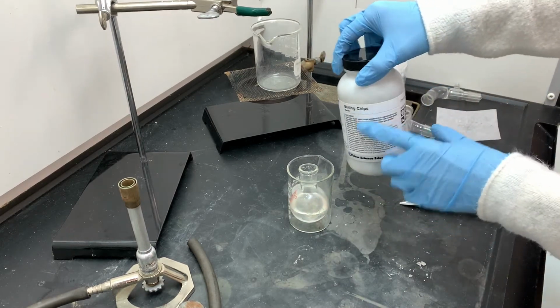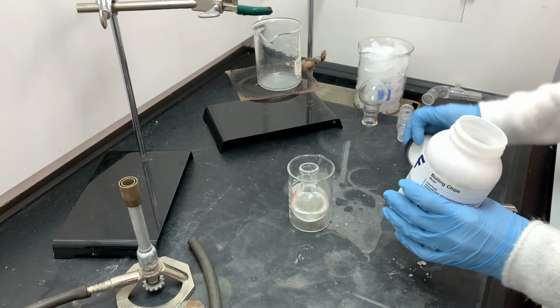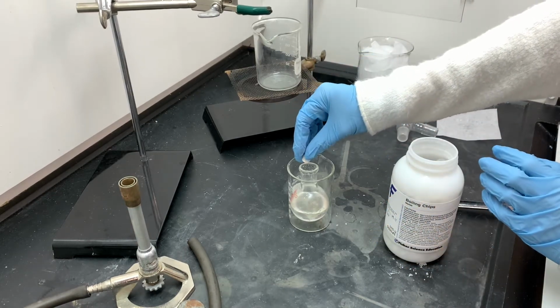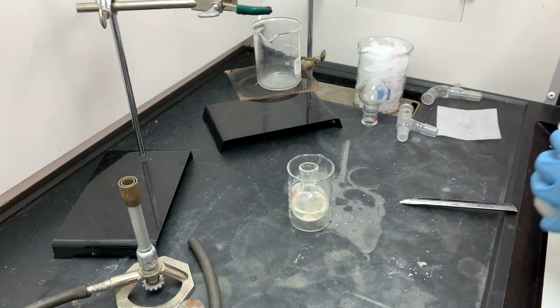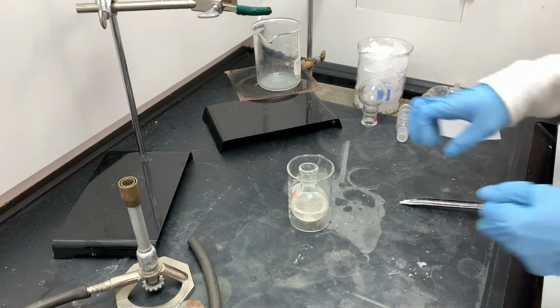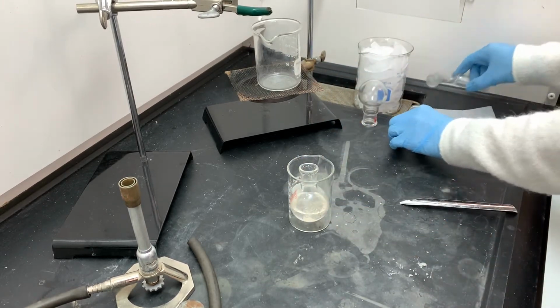The last component is a boiling chip. This is just a small rock. It is not a reagent, so it's not going to be used in the reaction. It's just placed in there to help the solution boil more evenly. Sometimes we use boiling chips in place of magnetic stir bars when we're not going to be doing magnetic stirring.